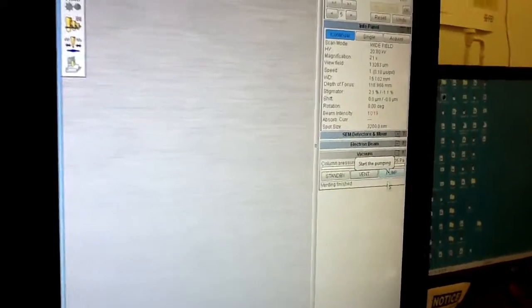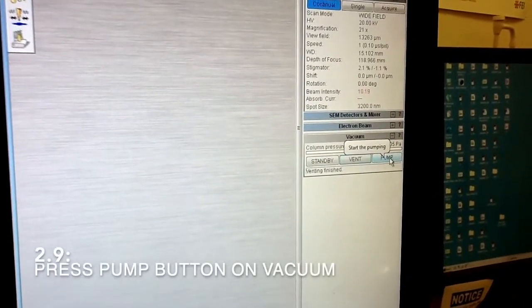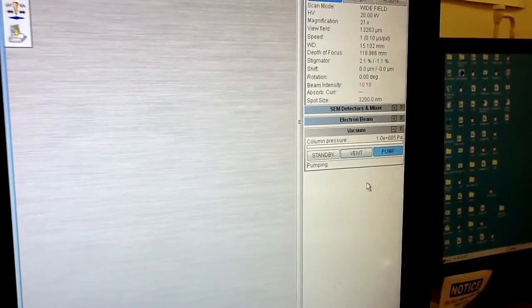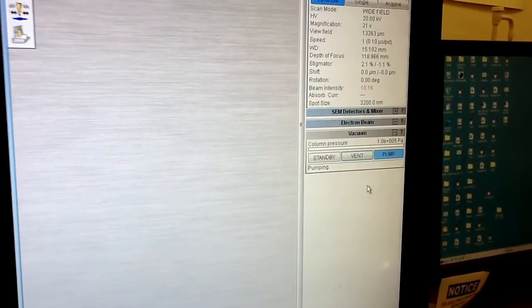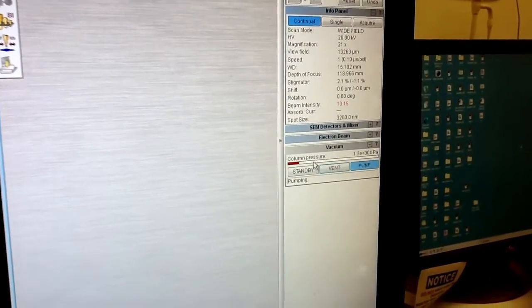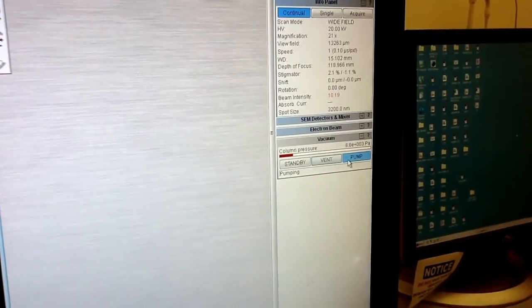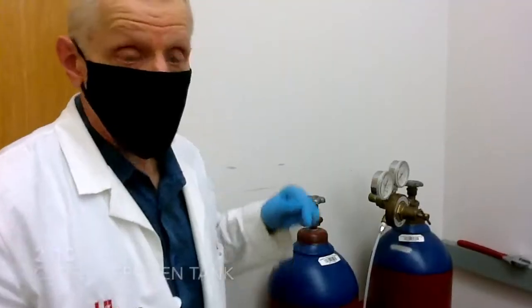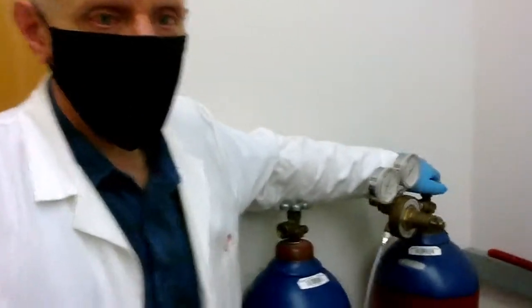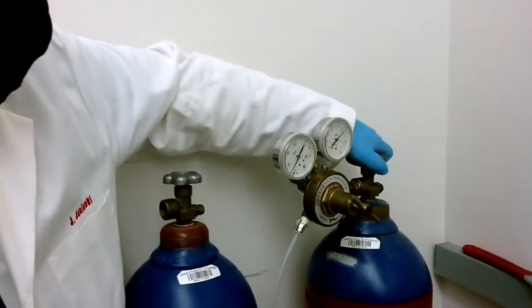Close the door and start the pumping sequence — just press the pump button. Then close the nitrogen tank by closing the main valve.